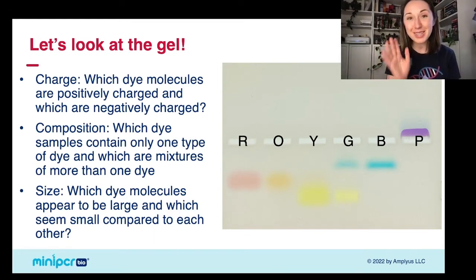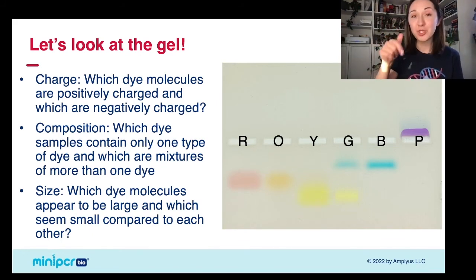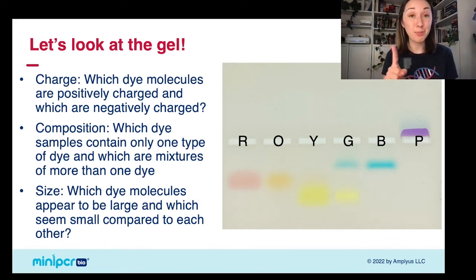Okay, so here we can see a picture of these gels a little more zoomed in and a little less shaky from my hand. Again, we have our red, orange, yellow, green, blue, and purple lanes. And you can see that red, orange, yellow, green, and blue moved downwards. So they moved towards the positive electrode. Our purple band moved up towards our negative electrode. And we've got some differences in composition. So let's walk through this together.